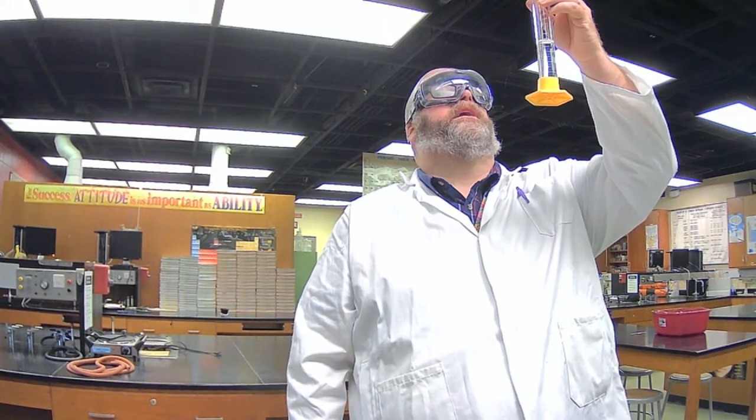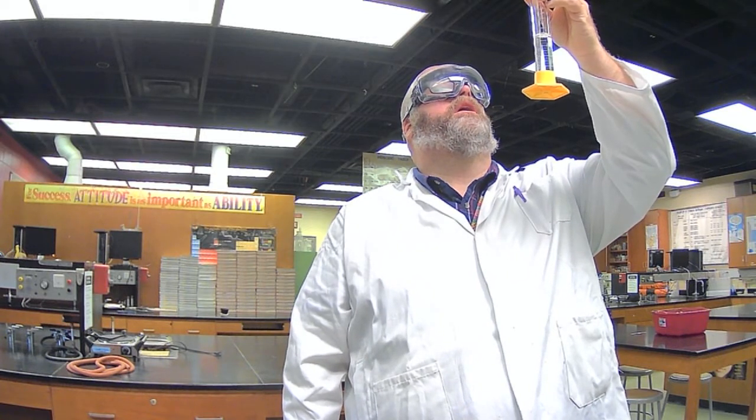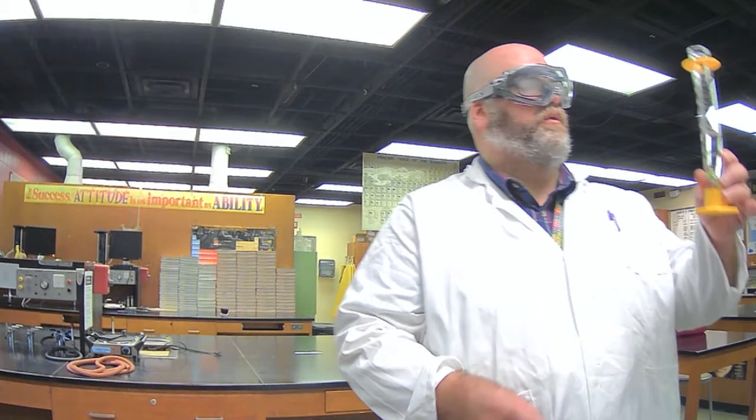Okay, so my initial volume of water is 46.9 milliliters. You need to type that in as your initial volume of water. Now I'm going to place the marbles in there. I'm going to be careful not to splash because that's going to change the volume measurement. I'm going to roll them in one at a time. Each one of them occupies and displaces its own volume in the water.